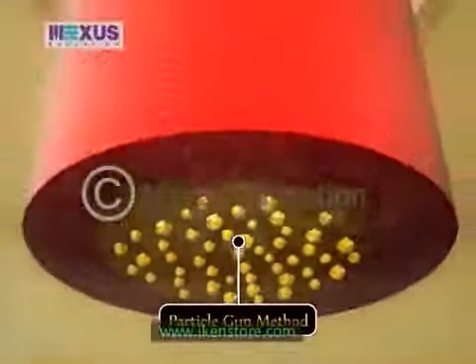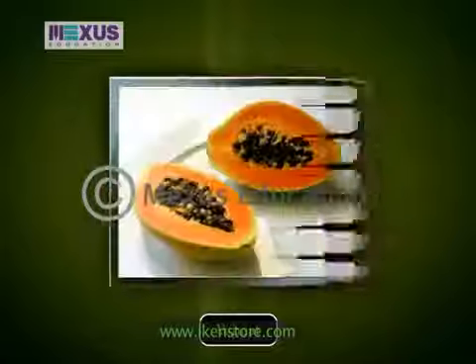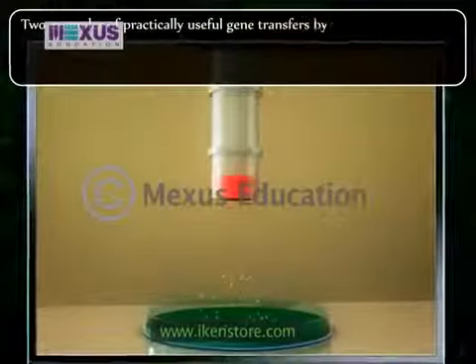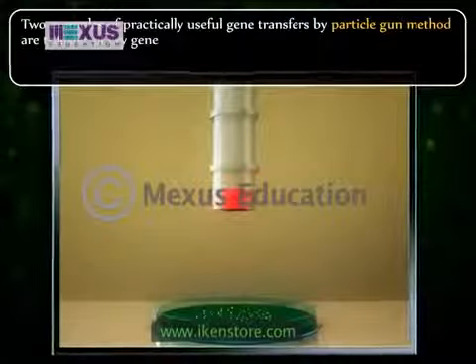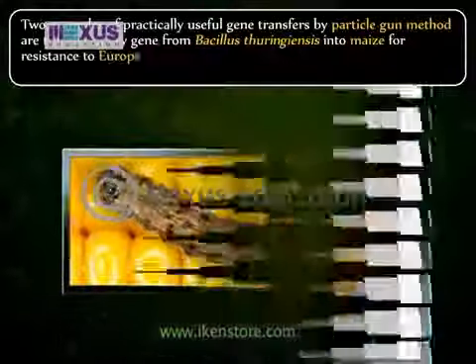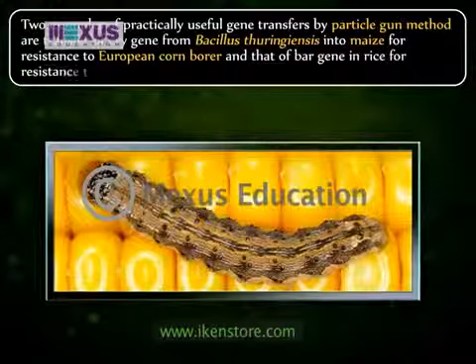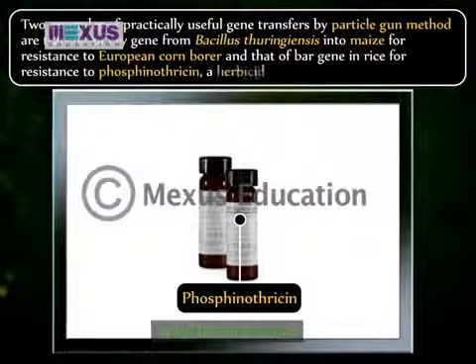Particle gun method has been used to produce stable gene transfers in cotton, maize, rice, sorghum, soybean, sugarcane, tobacco, wheat, papaya, poplar, etc. But two examples of practically useful gene transfers are transfer of cry gene from Bacillus thuringiensis into maize for resistance to European corn borer and that of bar gene in rice for resistance to phosphinothricin, a herbicide.